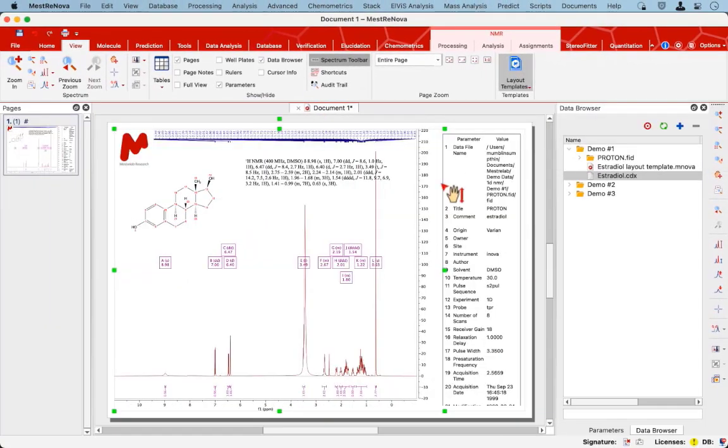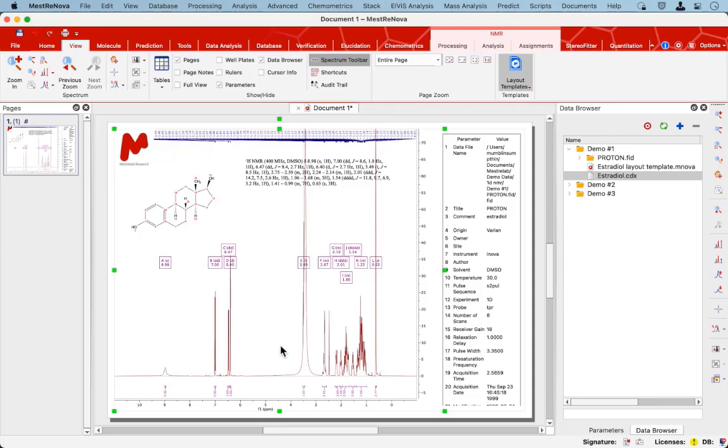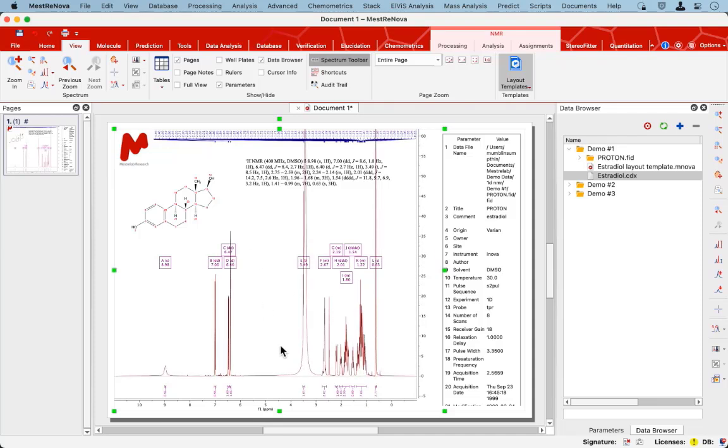And in the next few seconds, one can see that the spectrum has been transformed where the phasing and the baseline correction has been done.